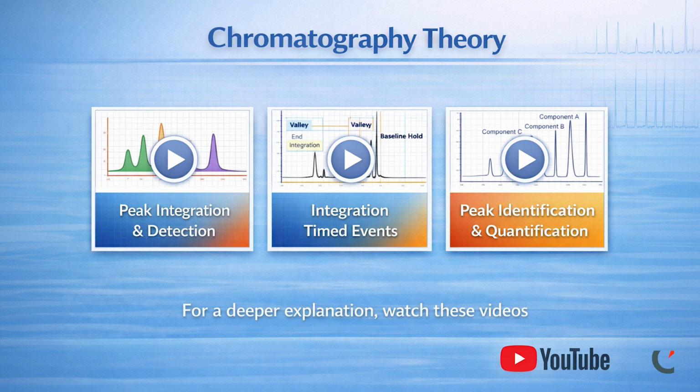The playlist is titled Chromatography Theory. It covers many topics, but has a section dedicated to peak integration and quantification. It provides an in-depth academic explanation of peak detection, integration algorithms, and quantitative calculations. Within this section, there are 3 videos: Peak Integration and Detection, Integration Timed Events, and Peak Identification and Quantification. If you would like a deeper understanding of the theory behind integration, we recommend watching that series.